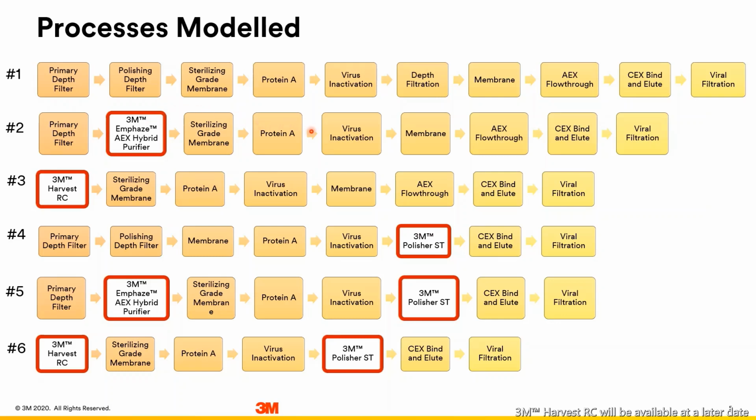There are impacts on the protein A column, particularly improvements in the purity post protein A, but also on the cell culture fluid stability. And we see reduced propensity for aggregation of host cell protein and DNA on reduction of the pH. And consequently, post VI, we've removed the depth filter from this process to take account of that.